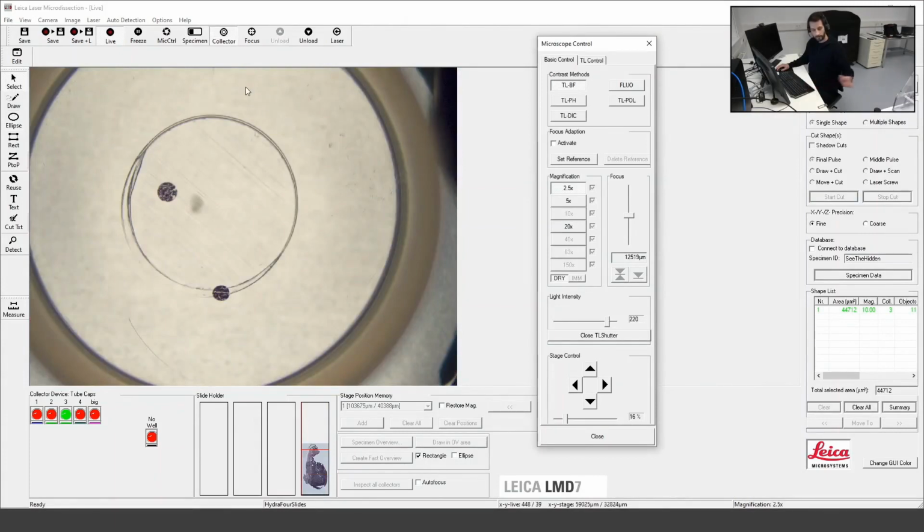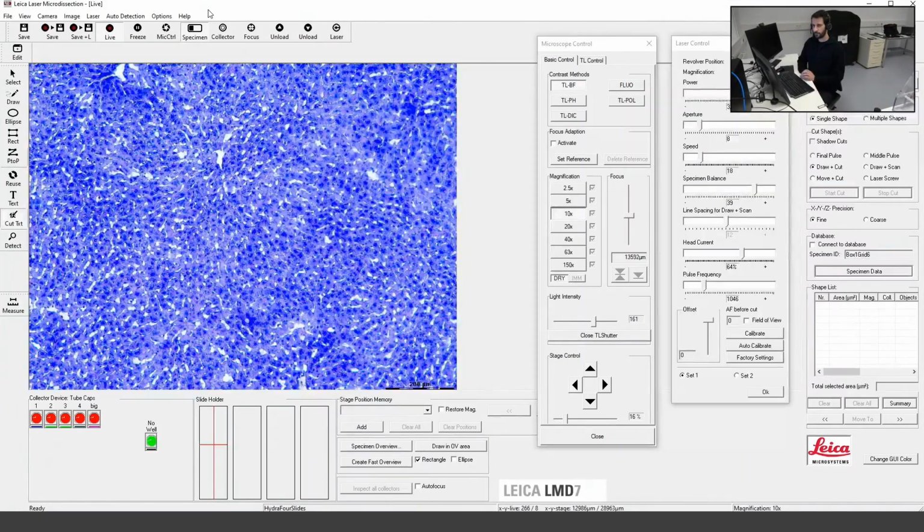You can see I really collected it. So there's another one which I just cut before the session here. And with this function, you can then prove, okay, I really collected my dissectate in the collection well.